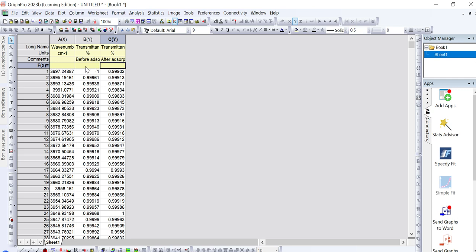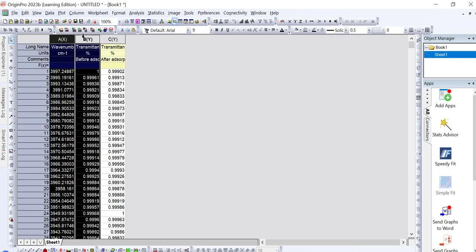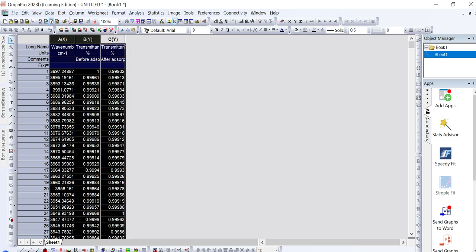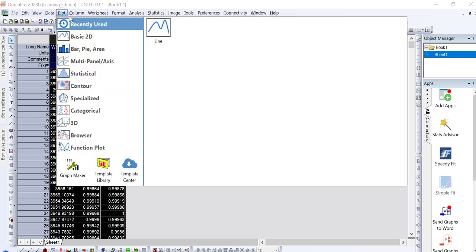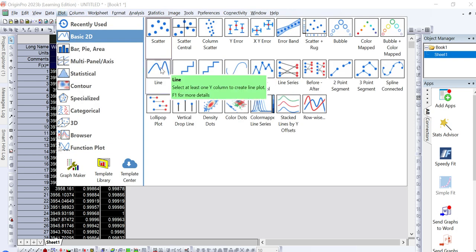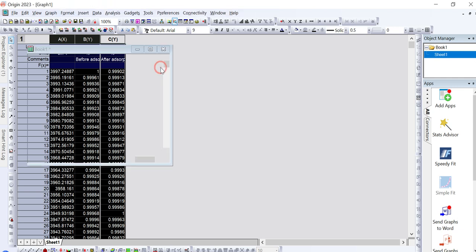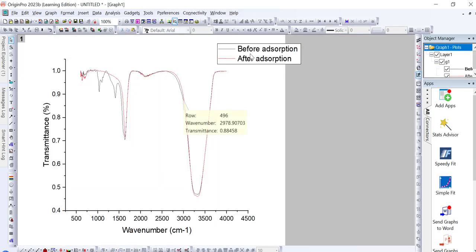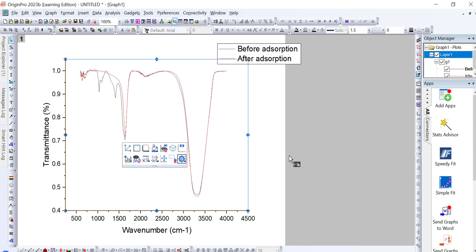After putting in your data and axis titles, select all the data. From the toolbar, select Plot and then choose the type of graph you want — for example, a line graph. The line graph will show the FTIR graph before and after adsorption, where the black line represents data before adsorption and the red line shows data after adsorption.